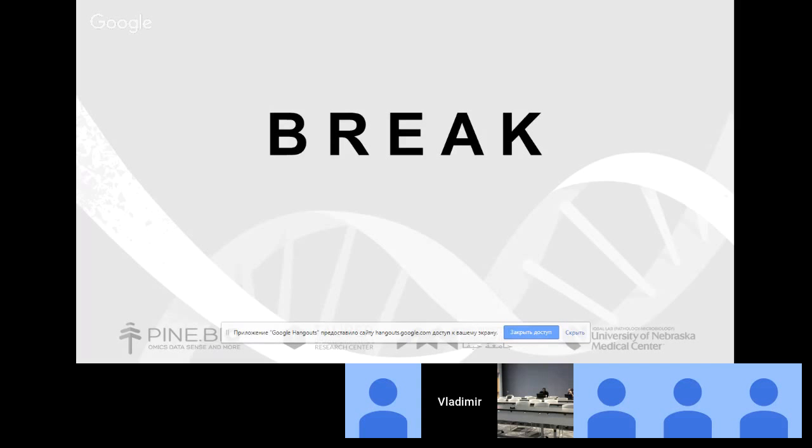Hello, Professor. Regarding annotation, after doing the DE-seq2 analysis, is the process automated to assign the annotation, or do we need to use DAVID and other applications separately to get the annotation reports?